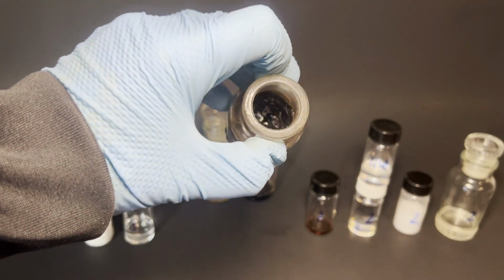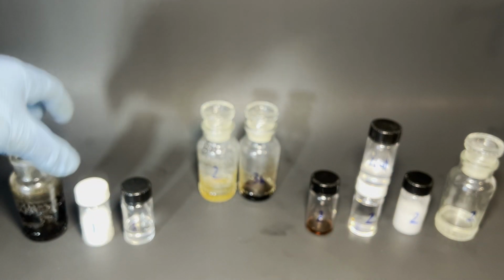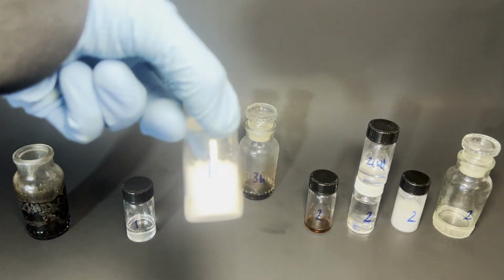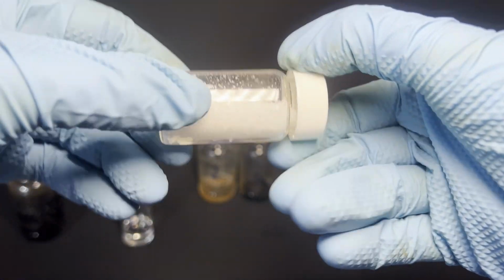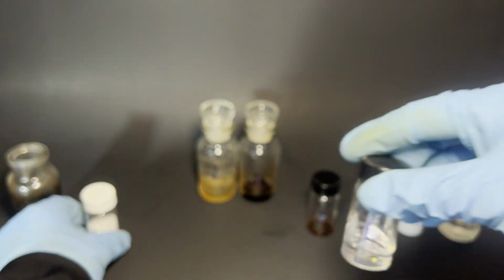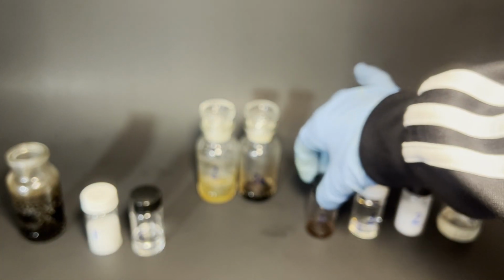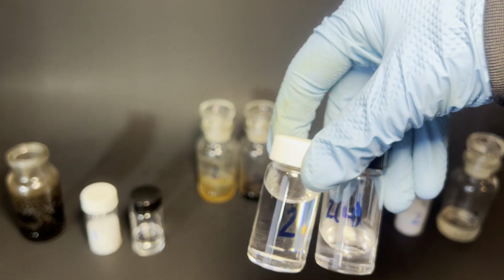On the left, the iron sulfur and TCCA sulfuric acid chlorination products, excluding the chlorobenzene that I cycled forward. And then on the right are the aluminum chloride nitromethane chlorination products. In the middle, those two vials, it's just leftover gunk, kind of tarry crap that I couldn't isolate anything from. I'll put in a slide listing out the weighed products from left to right.